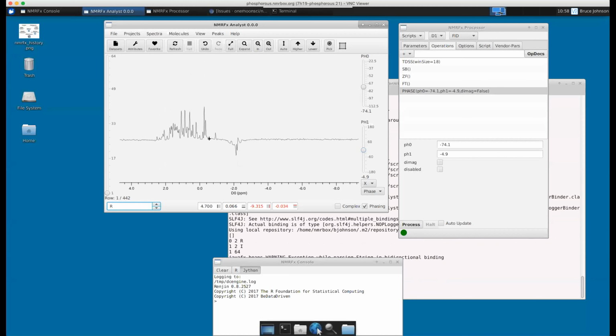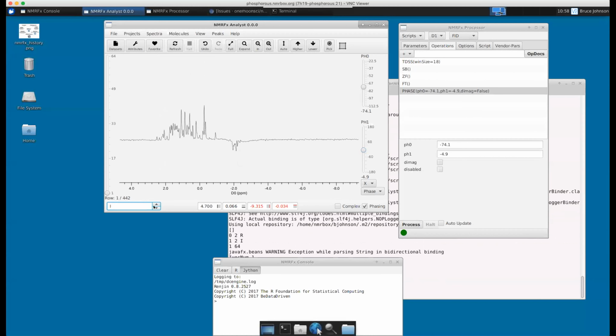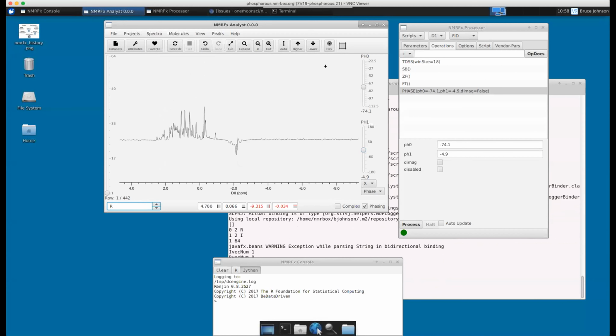If I was doing the traditional simplest method, we would see signal in the first row and no signal in the second row, because it would be 90 degrees out of phase. The fact that I see significant signal in both of these means that this was collected with a method that has one of several names: echo, anti-echo, preservation of equivalent pathways.